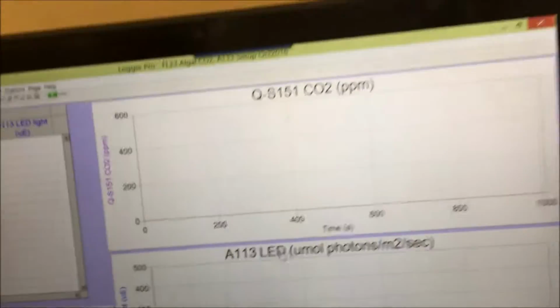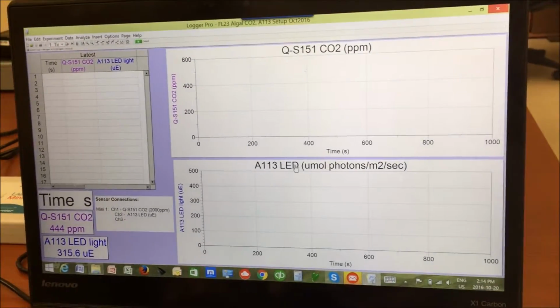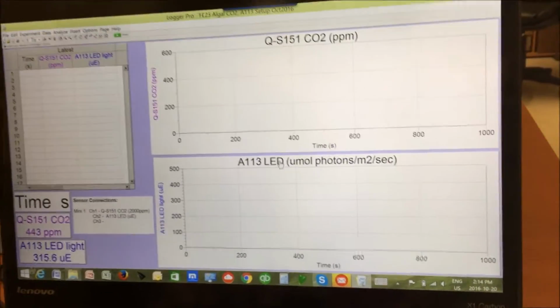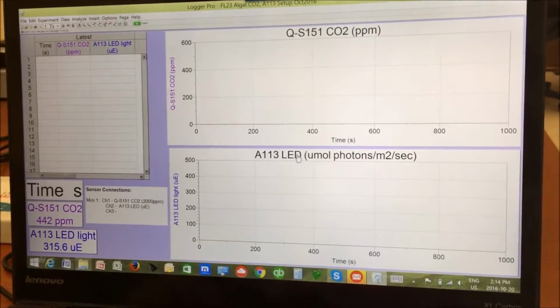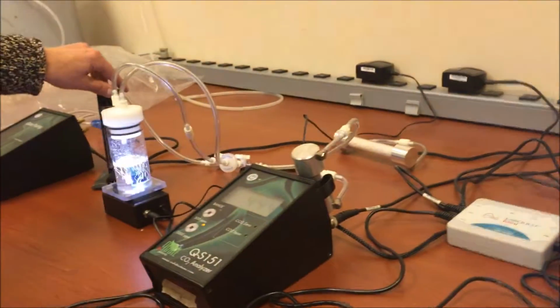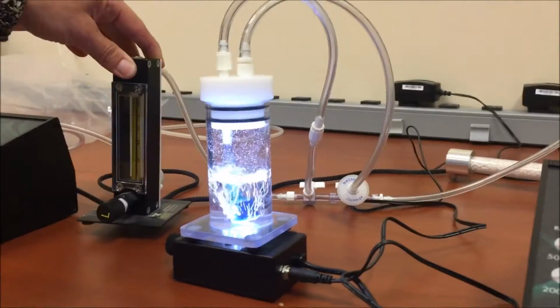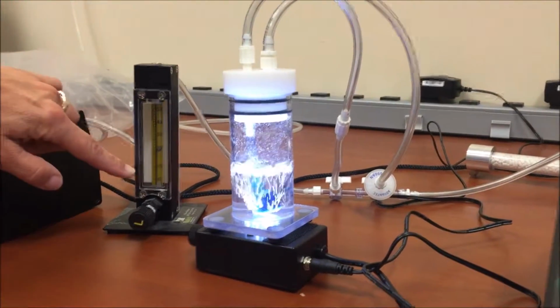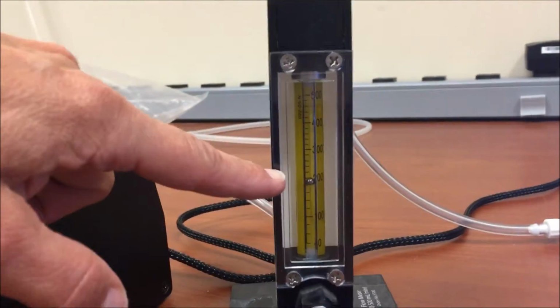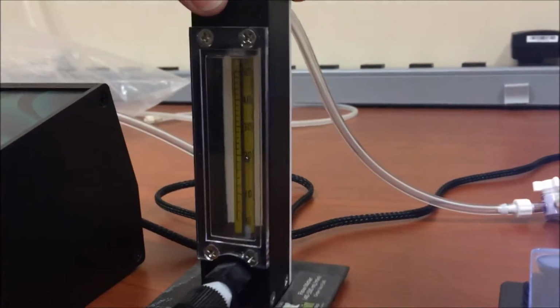If you also purchase with this package a mass flow monitor, then the signal from the mass flow monitor, which records the flow rate through the system, can be recorded in the software. But in this case we're only dealing with this rotameter flow meter, which is part of our standard package, and this does not record any signal. The flow rate has to be observed where the ball is floating, and that is our way of measuring the flow rate.